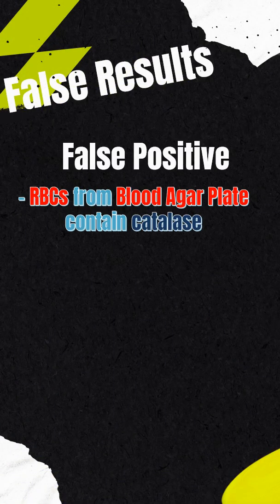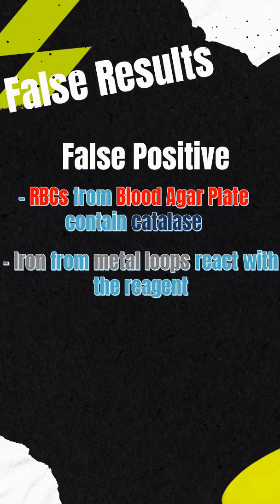Remember these important tips. For false positives: don't scrape off the agar when getting colonies from a blood agar plate, as red blood cells contain catalase. Also, avoid using metal loops since iron can react with hydrogen peroxide.